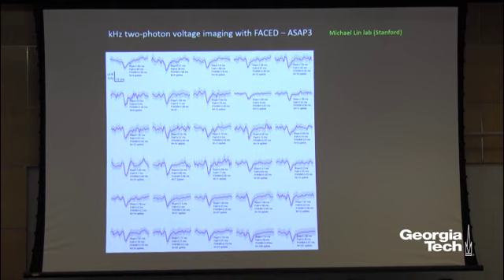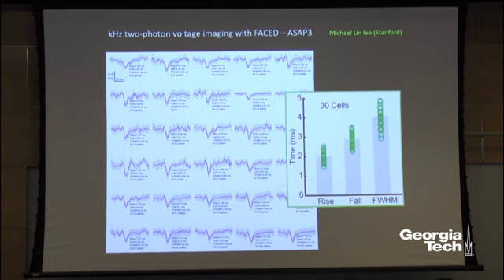Those are all the in vivo cells that we actually image. It's about 30 cells, ranked by the number of spikes that we detected. Even when it's 8 spikes, we can clearly see those transients. We could also fit those responses and determine the rise time, fall time, and full width half maximum of the optical spikes that we got. Those values are very much in line with what Michael's lab knows about the sensor's dynamics.